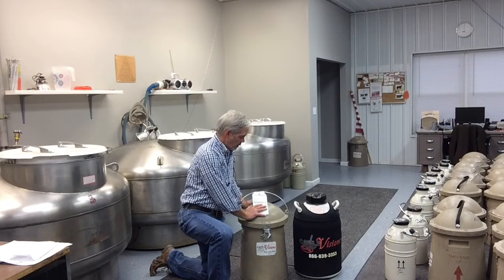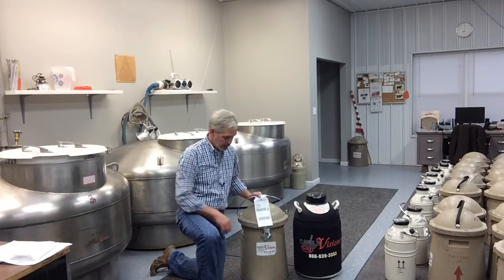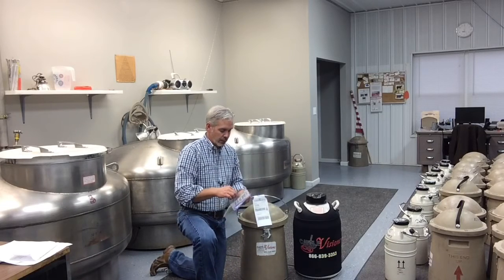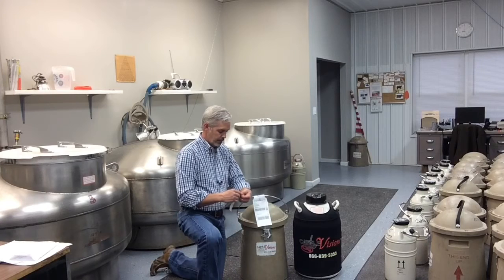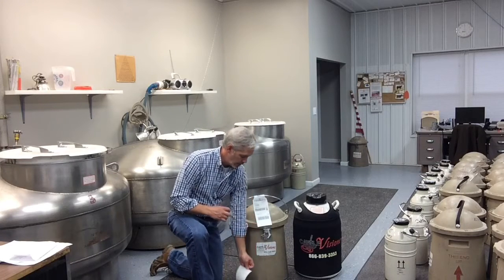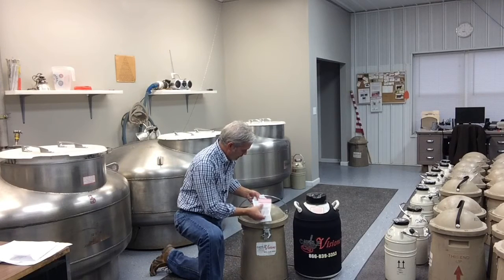You'll find the shipping label on the handle of the shipper tank, and you'll want to take the return label that's in the packet and put it over the top of the existing label.